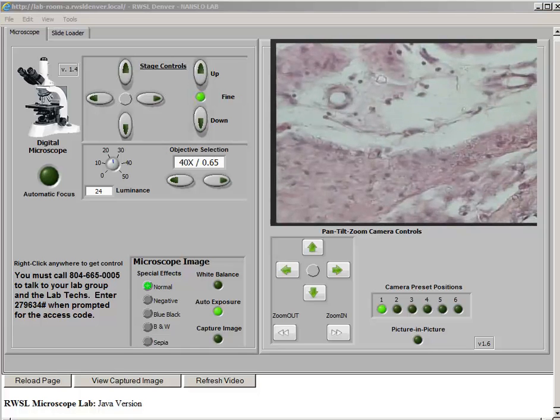The camera on this microscope allows you to capture and save the microscope image. When the Capture Image button is pressed, a 5-megapixel image is opened in a new tab in your browser. When the image is being captured, the button will illuminate light green. The capture is complete when the light turns off. Be patient, as this may take several seconds to complete. After the capture image light turns off, select the View Captured Image tab on the bottom of this control panel to view the image.